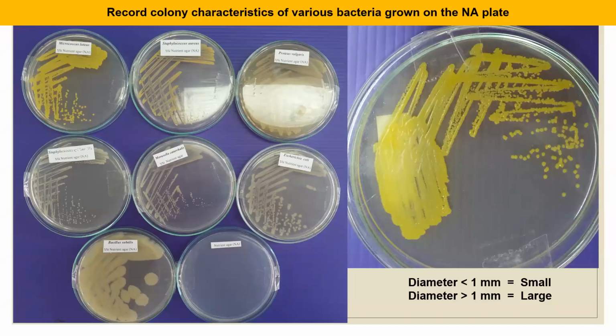Let's move on to the next practical. We are going to study and view the morphology of the bacteria. For identification of bacteria, you will have to use macroscopic morphology and also microscopic morphology. For this slide, I would like to introduce you to how the bacteria grow on the agar plate.